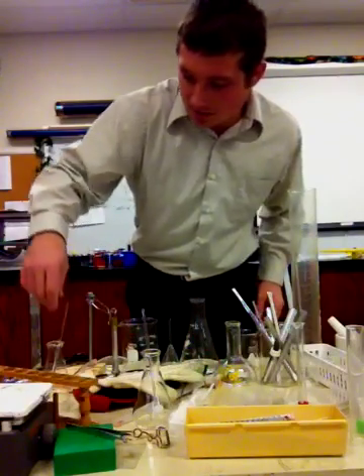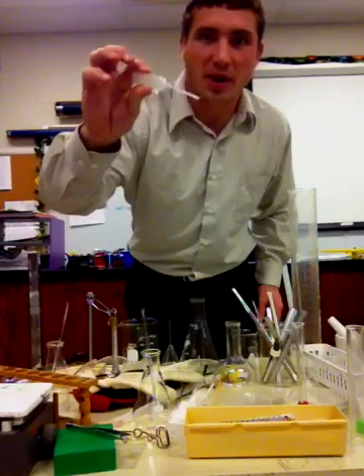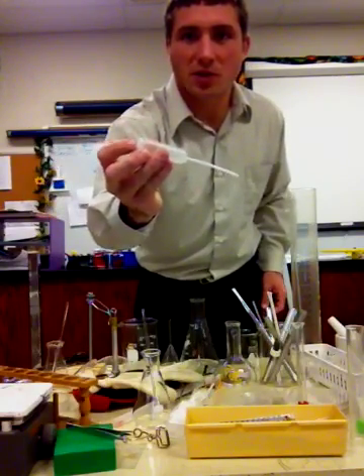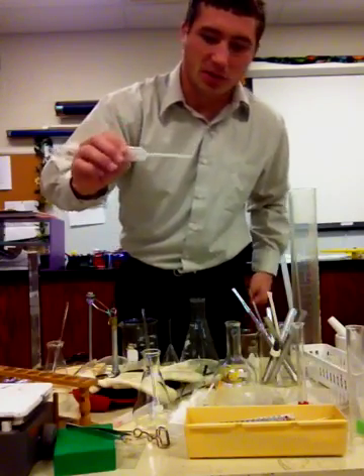The next thing would be our little pipette. This is a pipette. You will notice the large end and then a very skinny straw-looking end on the other side.